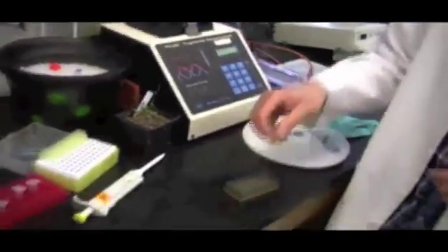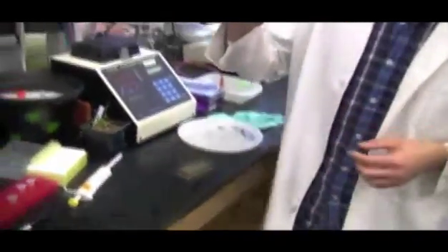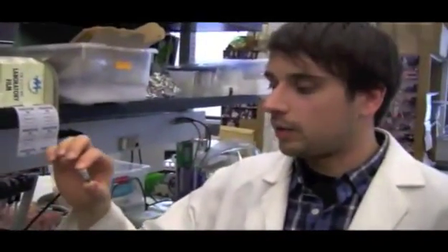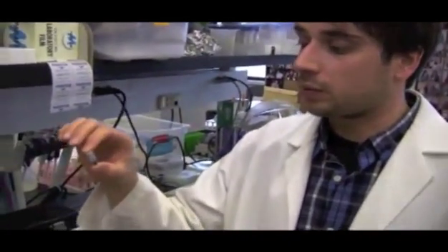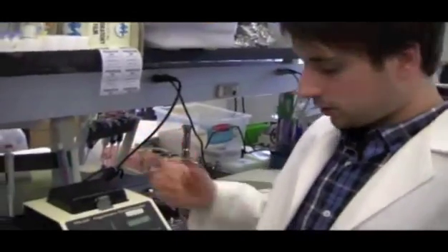Okay. So now we have a lot of copies of our gene, so just our piece of DNA. But sometimes the protein that's in there will start and stop and kind of make little chunks of DNA, so like little pieces of the page that we want to copy, but it might not be perfect. So what we're going to do is we're going to purify this a little bit, so we only have our nice perfect chunk of DNA that we know codes for our protein. And we do that by running it out on a gel.